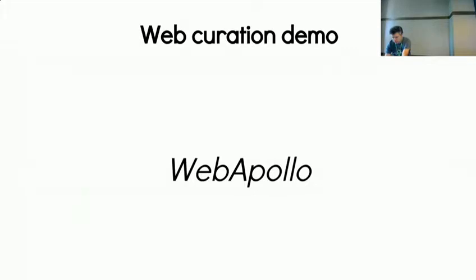Additionally, we can change the annotation type, so if we decide it was a pseudogene, it'll go through and change that. You can do all of that within Apollo as it stands now, and then export GFF3, FASTA, and so on.